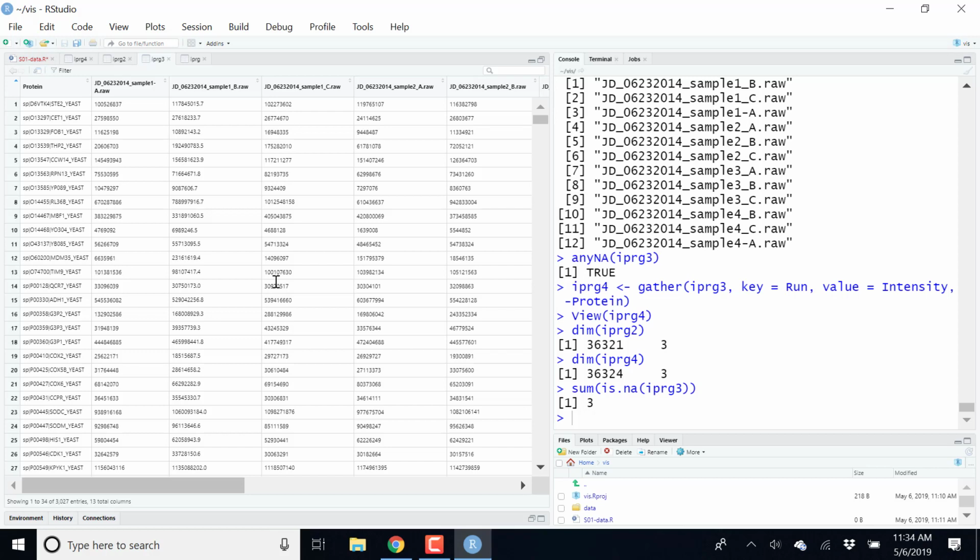Well, these values are actually all the values in my table. There are additional samples here on the right that you can see. But protein, these are not the quantitative values. This is a column of its own with metadata that should not be gathered to create a new intensity column.